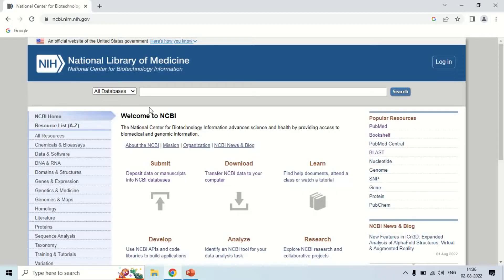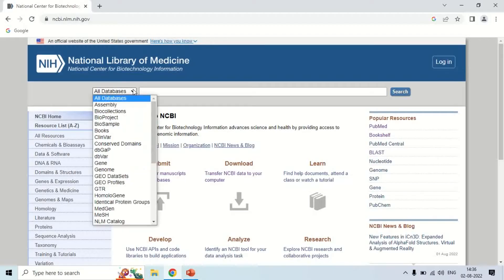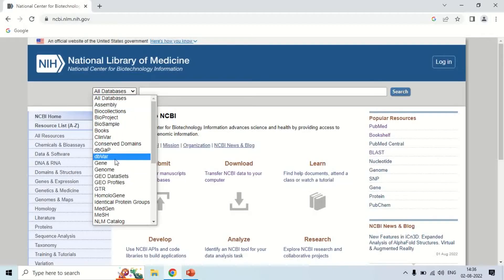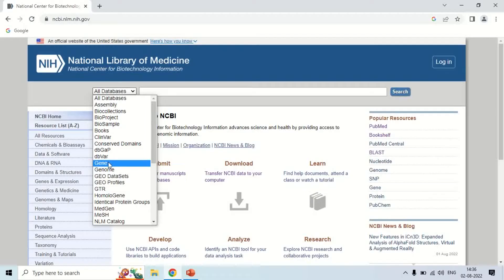To show you a demo, I am going to design a primer for a gene. For this, select the gene database and, for example, I am going to search for the hemoglobin beta gene — HBB — and search it.